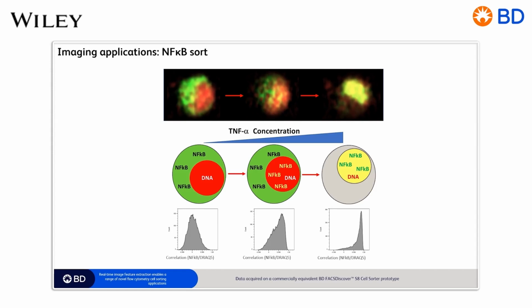And that's reflected in those histograms at the bottom, which is essentially the correlation score. The median of that correlation peak on the left is at or around 0. As you move towards the translocated version, that median gets closer to 1. Something that's fully correlated would have a correlation score of 1.